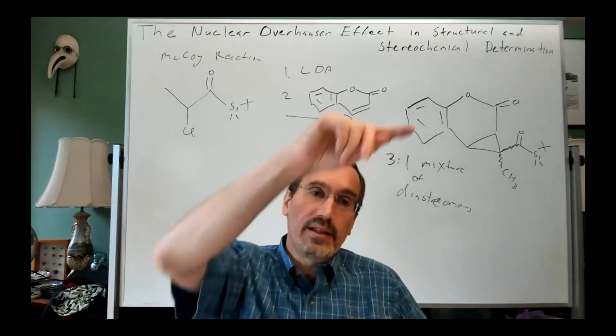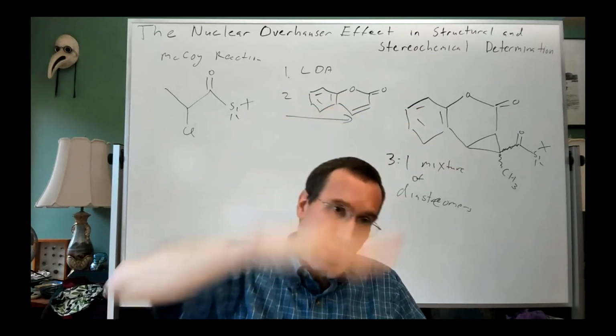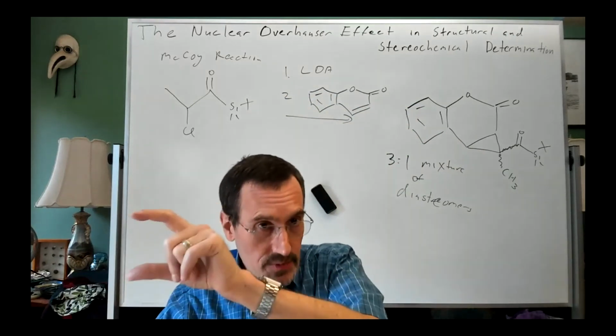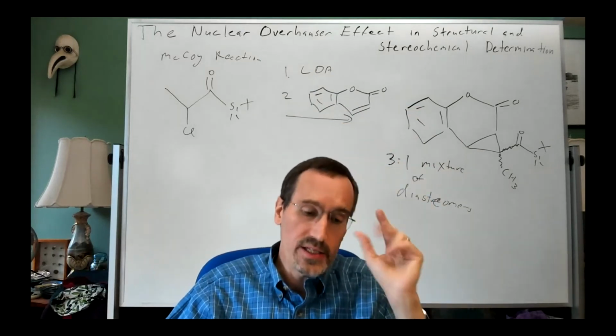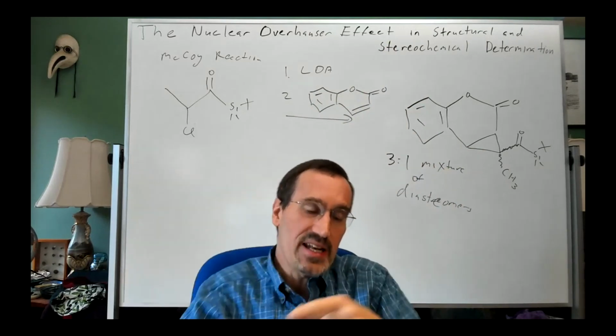Quick question. When you're measuring the integral that seems to be the biggest, are you measuring it all the way down to where it stops? Yeah, I'm measuring basically from the flat point on one side to the flat point on the other side, very much like we're doing in our 1D spectra and our regular spectra, where you're using a ruler or grid lines on the spectrum here, but I'm doing it downward because it's a negative peak.